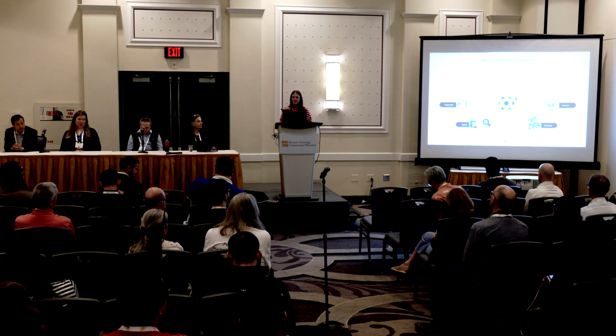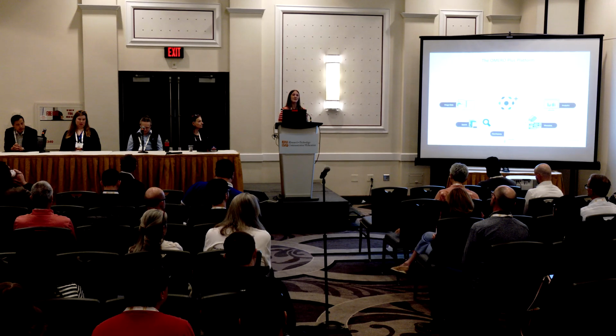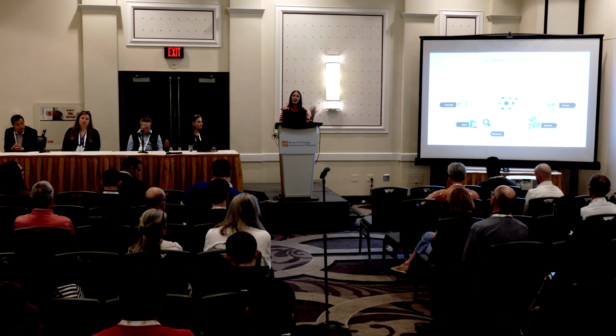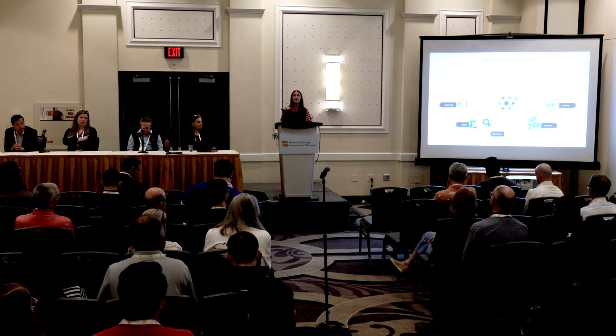And importantly, especially in the core facility world, you might want to manage the permissions of that data. So you're not just acquiring data in the context of a single lab, but you're helping users acquire data across lots of different labs. And maybe not everyone should have access to everything. And so an image data management system needs to manage the permissions, how you access and what you can do with all of this image data, metadata, et cetera.